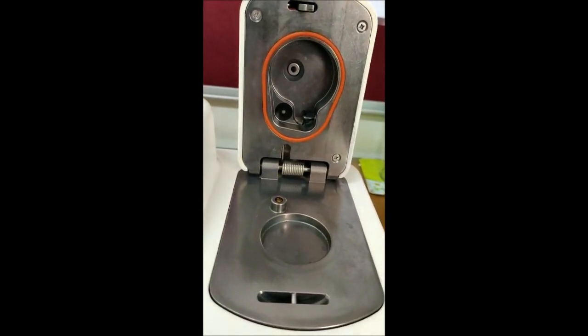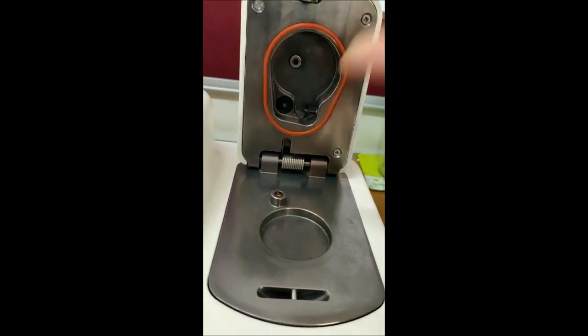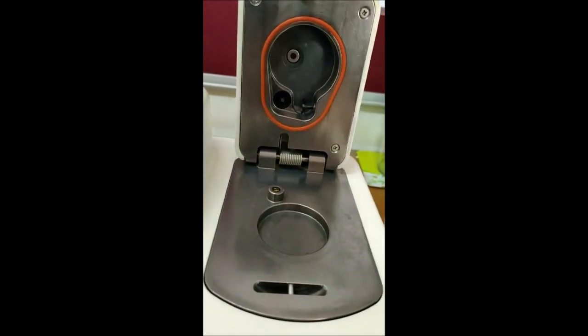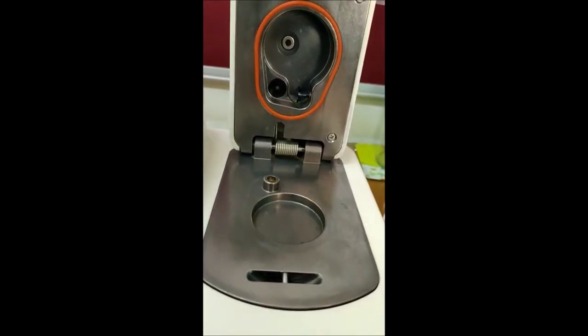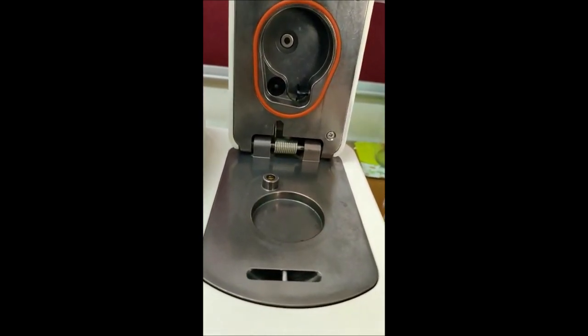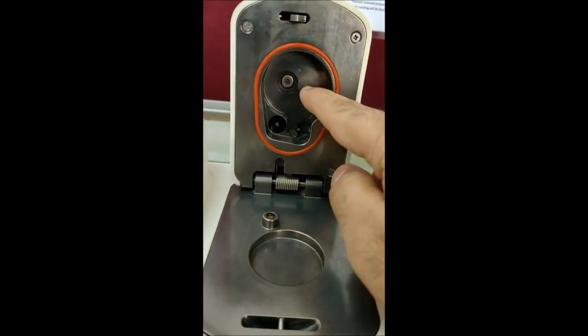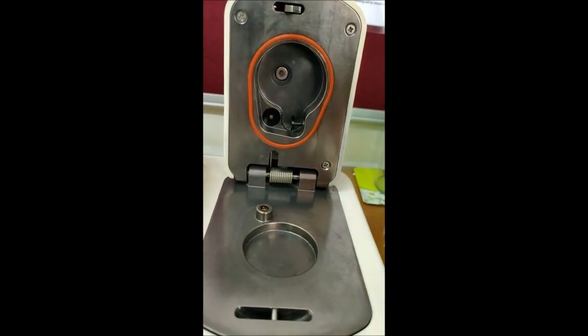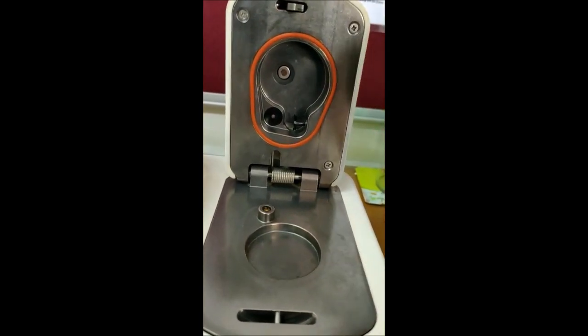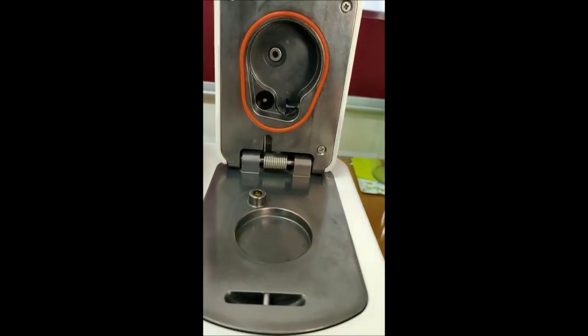To measure the dew point we have this optical sensor which is throwing infrared light to this. And when the condensation happens on the mirror it will exactly note the dew point temperature. This is the thermopile which is going to measure your sample temperature. And the small fan here is used to circulate air which will enhance the rate of equilibrium.